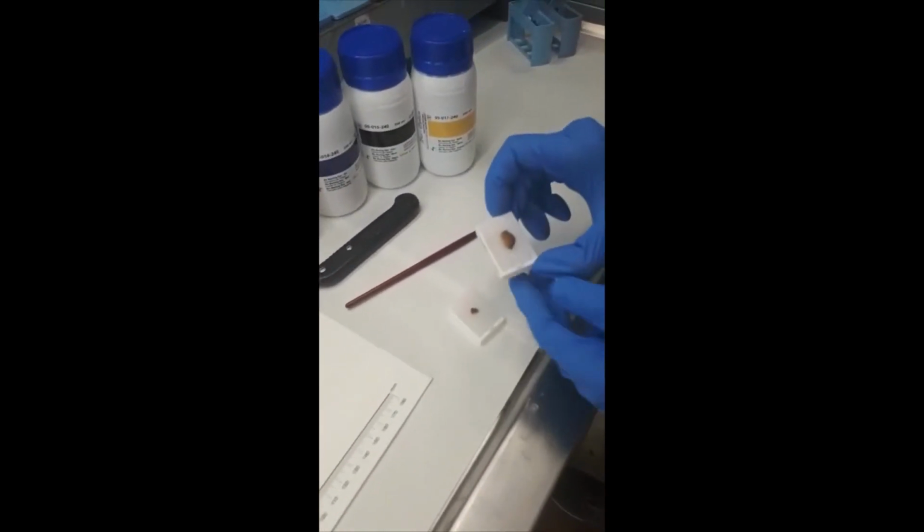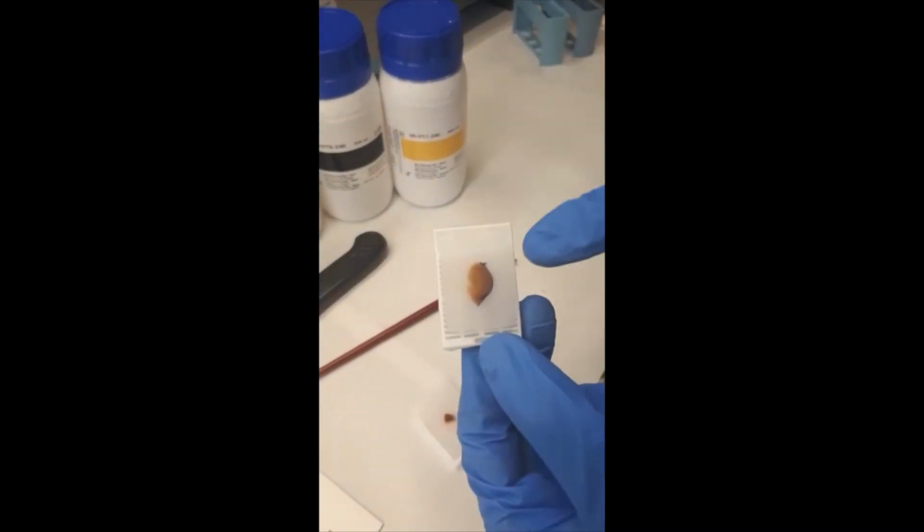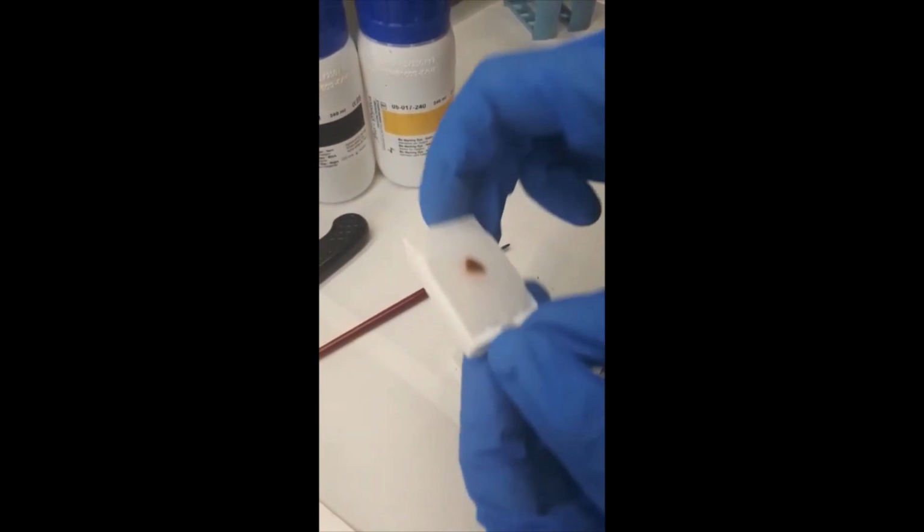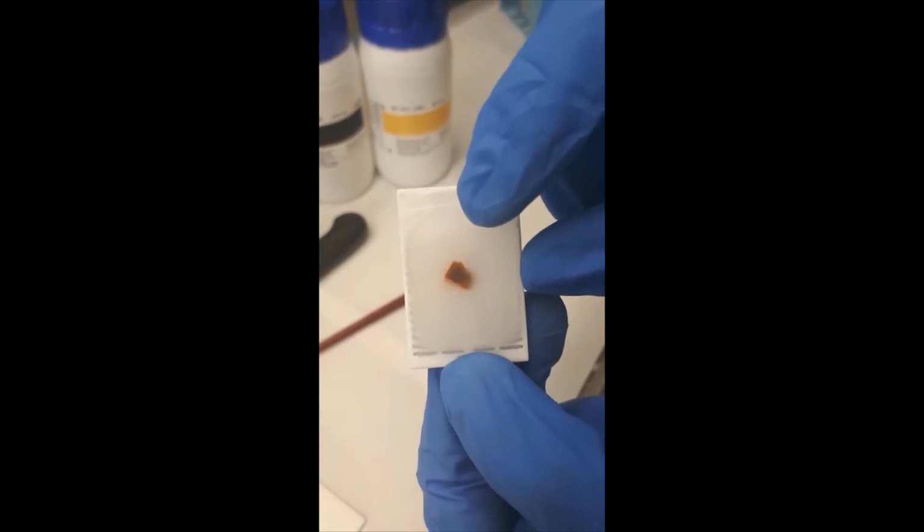So we will have the tissue with the margin. This is the blue, for example, or the orange.